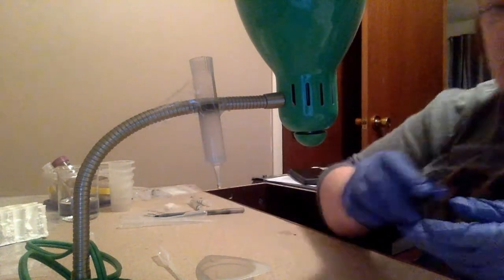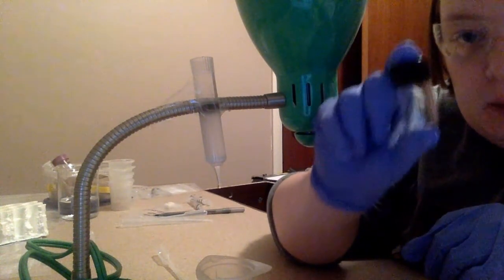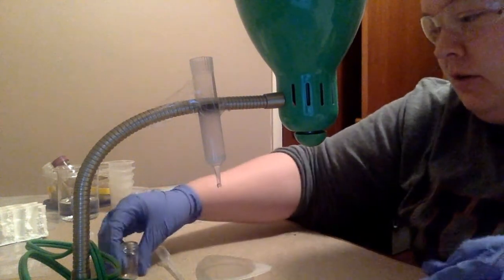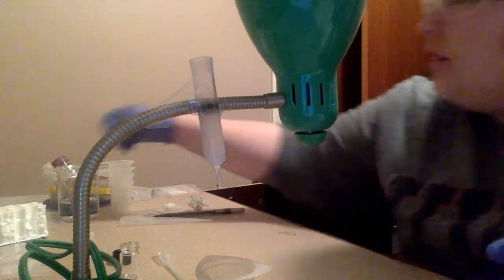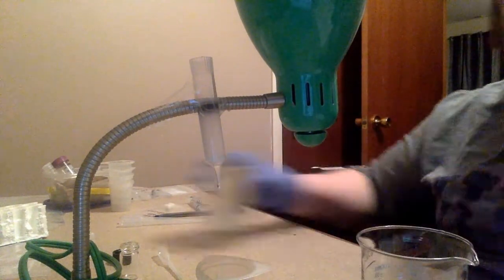And I bought this special little vial here. I'm going to use this one to collect anything that might look red. And I have some other test tubes here to collect any other bits that we see. So we want to pay attention and be very careful and ensure that we are looking for colors as they come out.